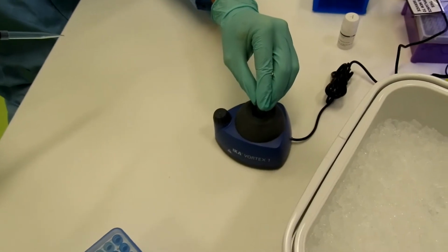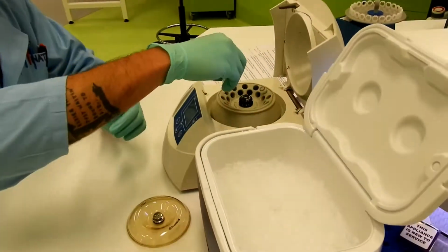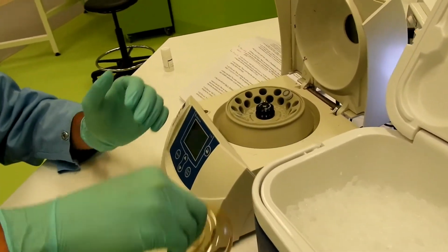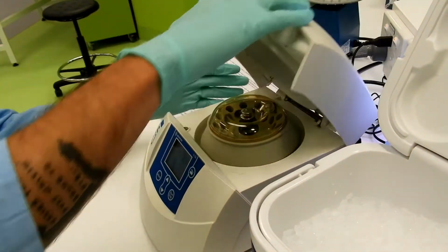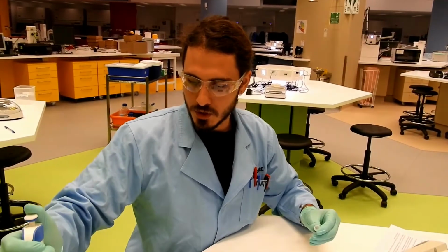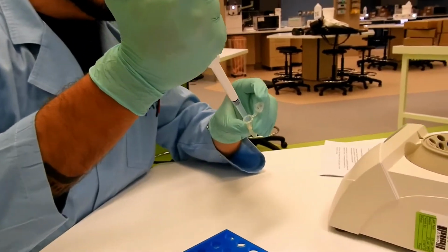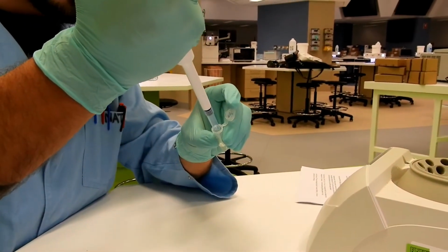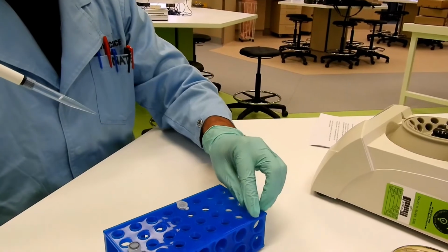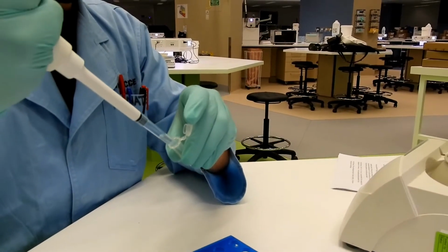Vortex, and then incubate on ice. After incubating the sample for 5 minutes, we'll then centrifuge for 30 seconds at 10,000 g. Now, avoiding the pellet, we'll transfer 600 microliters of the supernatant into a clean tube. I'll emphasize that we want to avoid the pellet because this contains all of our non-DNA cellular material.